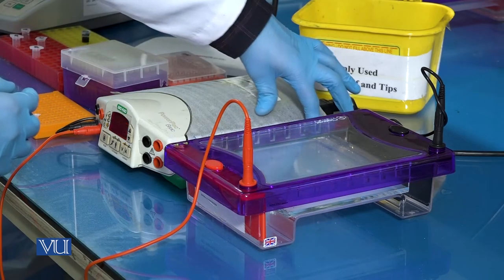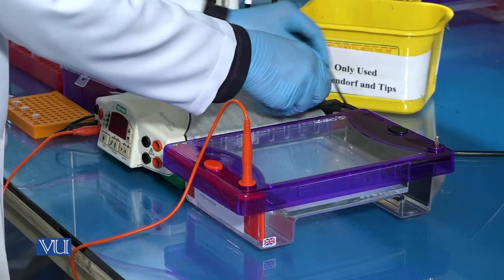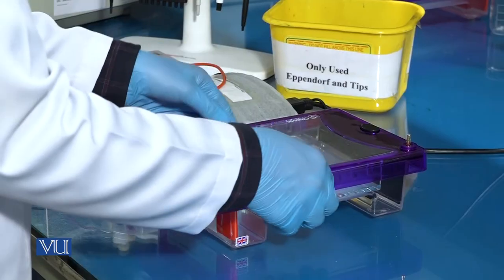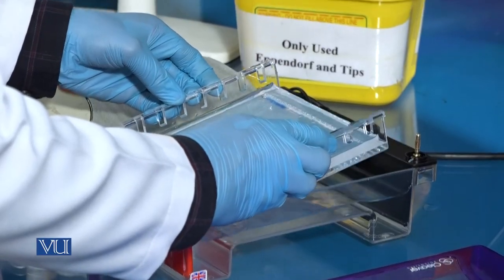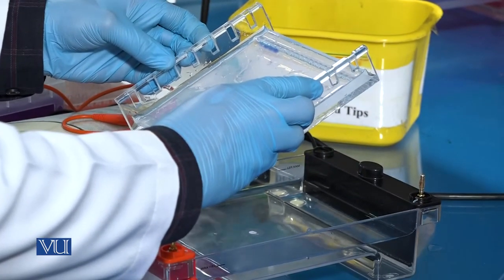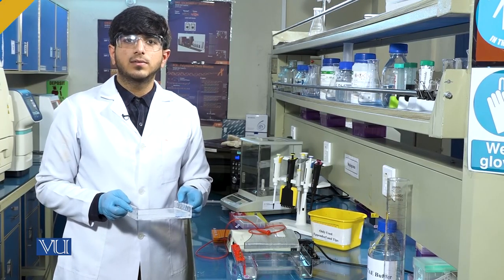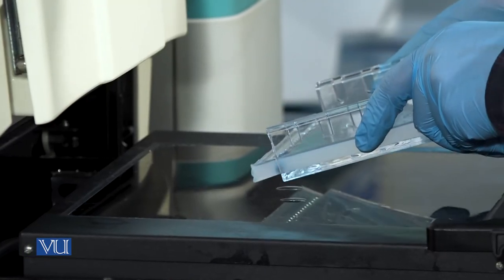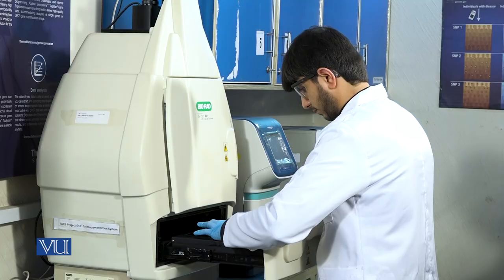When the gel run is completed, turn off the power supply and take the gel out of the tank. Now we will visualize the gel in the gel dock. We will observe the gel under UV light in the gel dock. Here we can confirm the DNA through the bands on the gel.